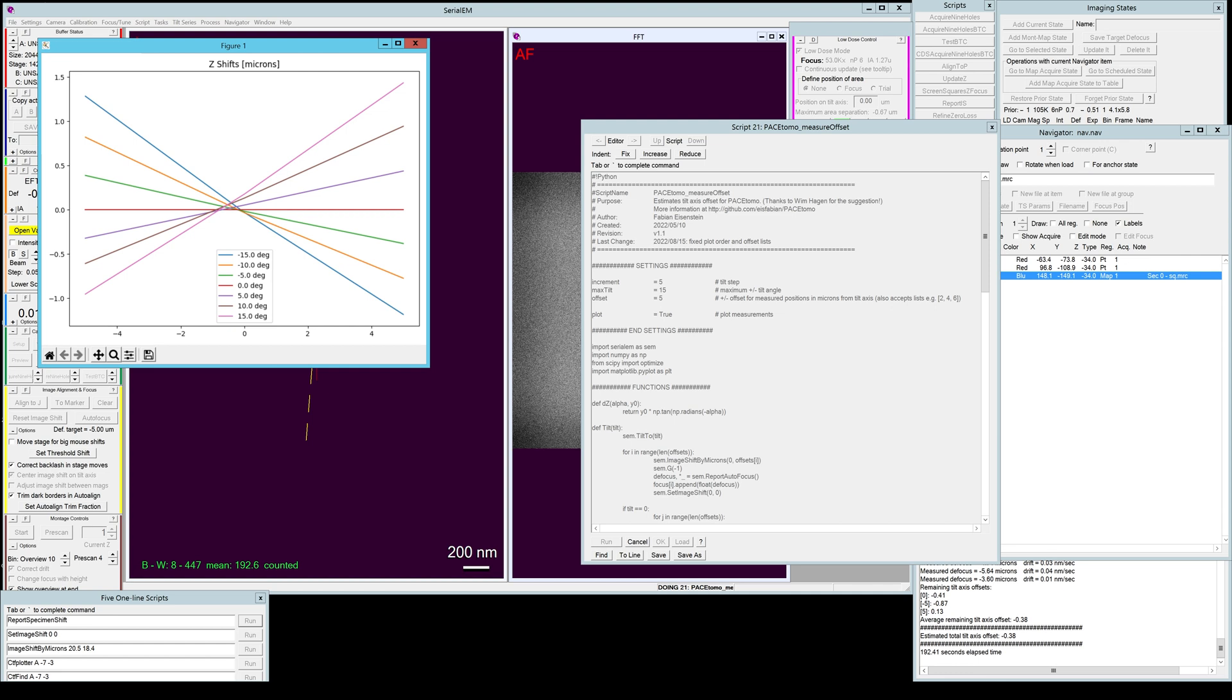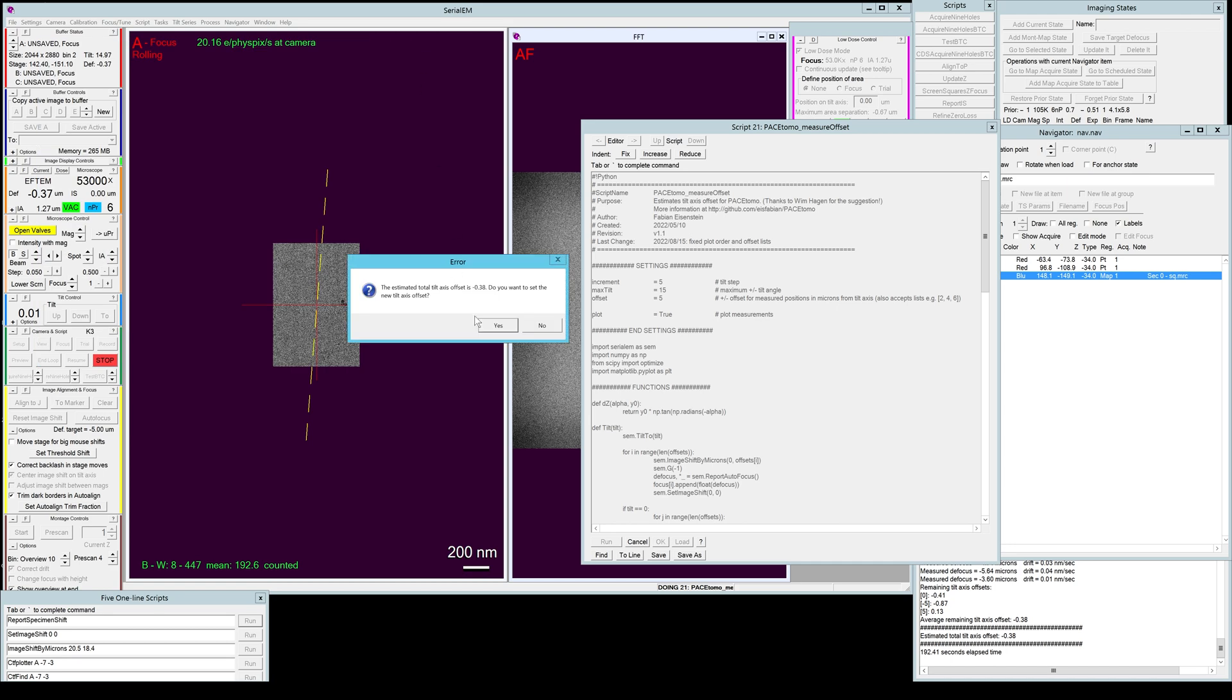Then depending on the slope you can adjust this value further for your future sessions. But this value should already keep it within about a micron of the focus spread of the tilt series. You can get it better but it is a good start.